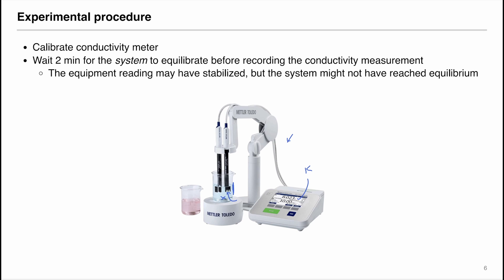Before taking each measurement, make sure to wait at least two minutes for the system to equilibrate before recording the conductivity measurement. By system, I don't mean the number that is shown on the screen. That is the instrument.